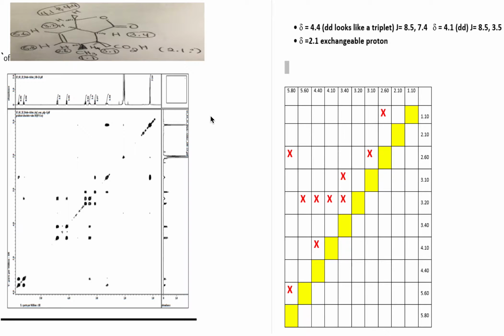Sorbic alcohol and maleic anhydride react to give a bicyclic product. This is a Diels-Alder followed by an intramolecular acyl substitution reaction. The structure of one of the isomers of the product is shown here. The product has 10 non-equivalent protons.